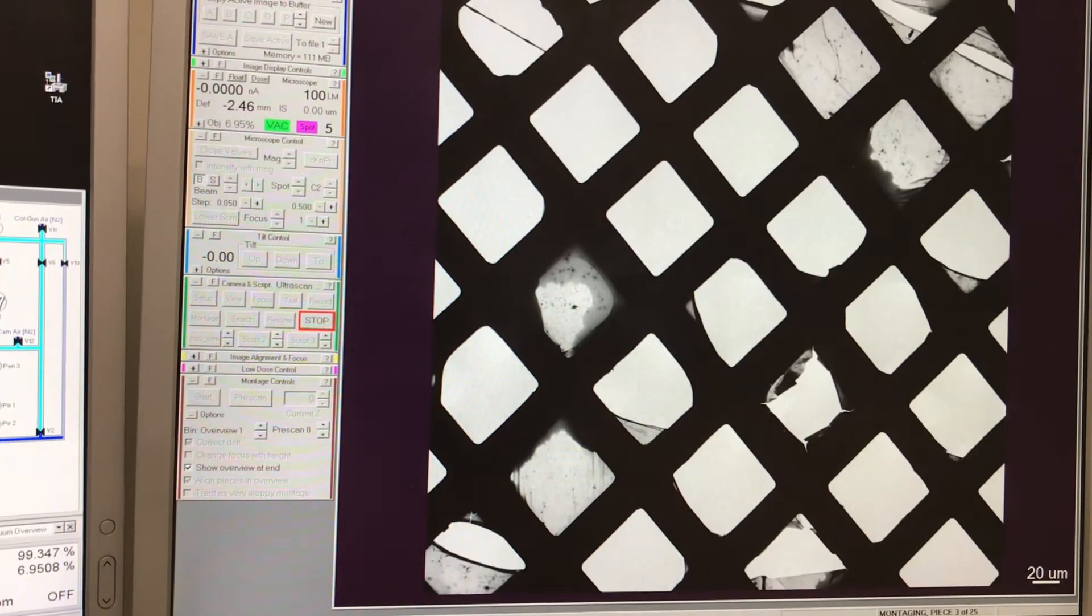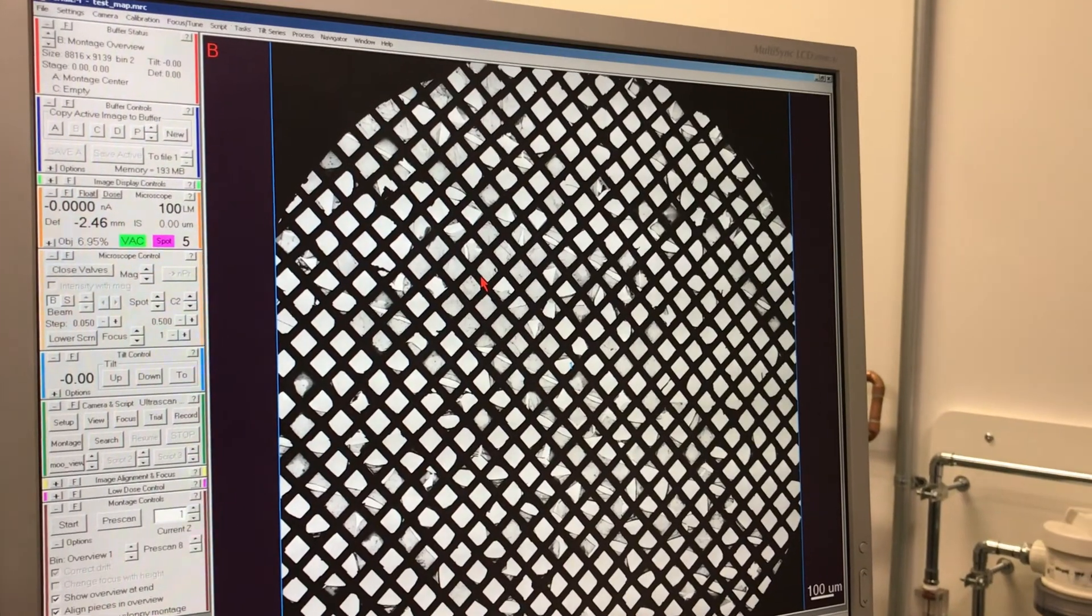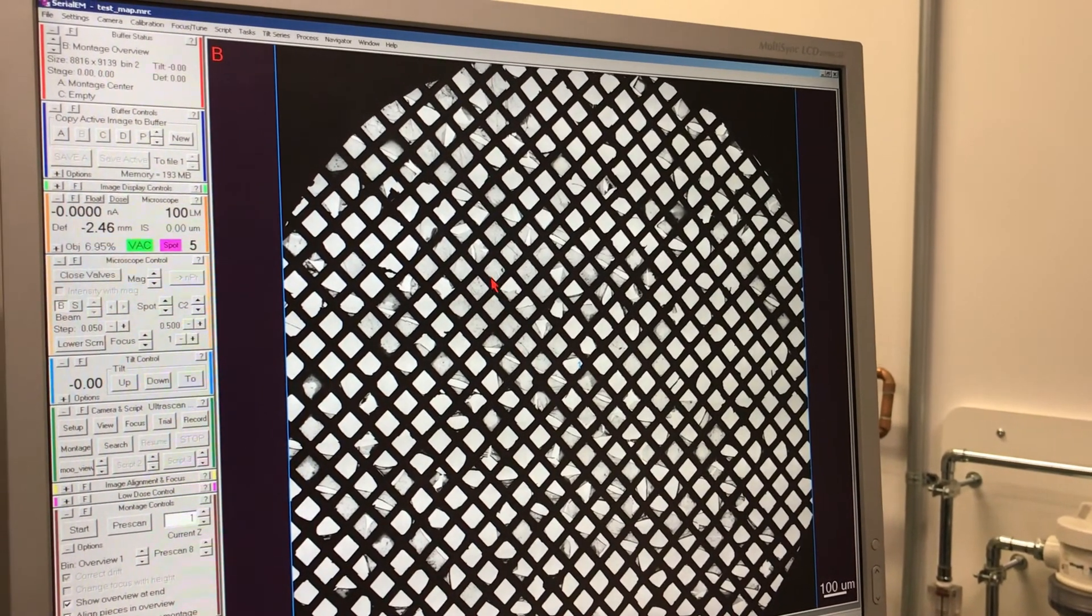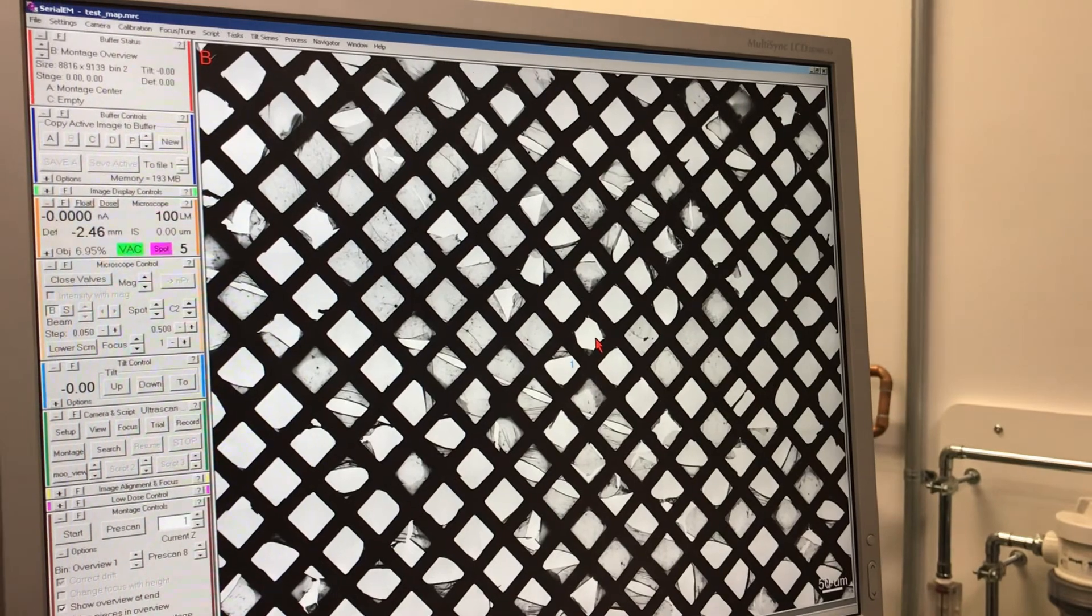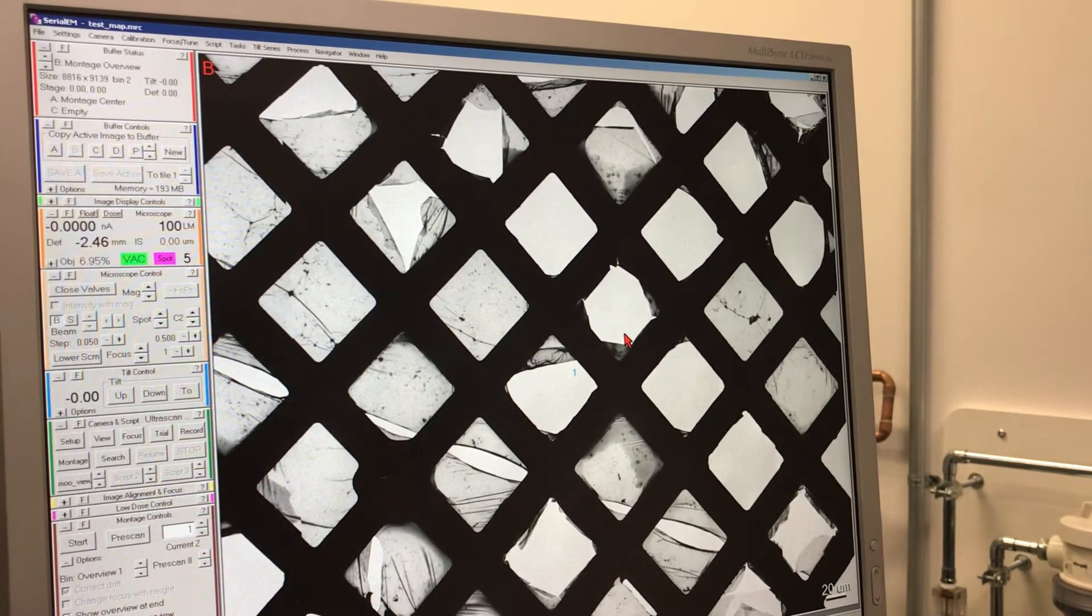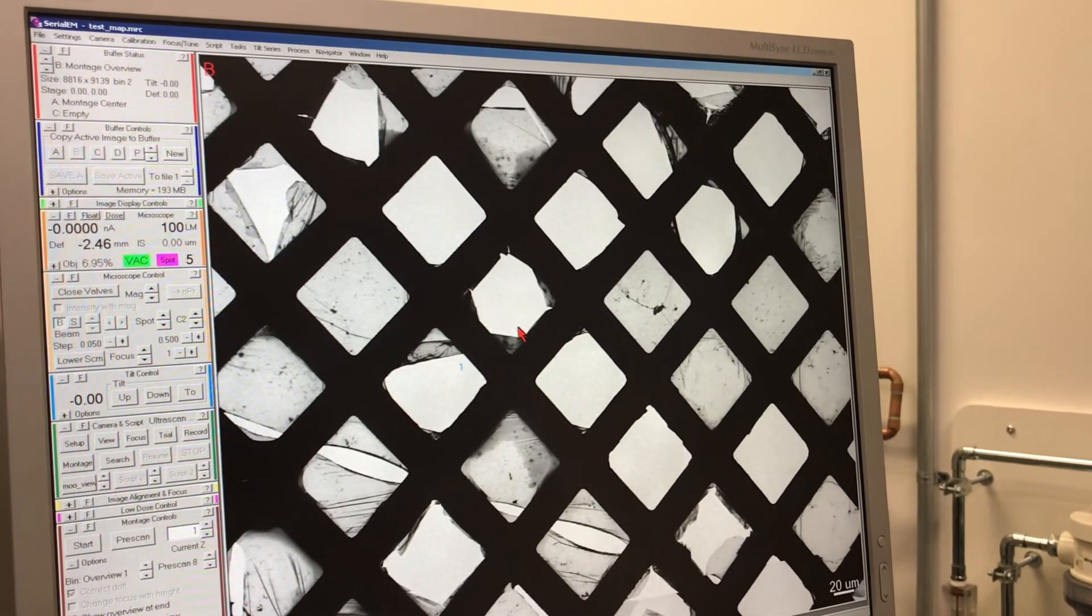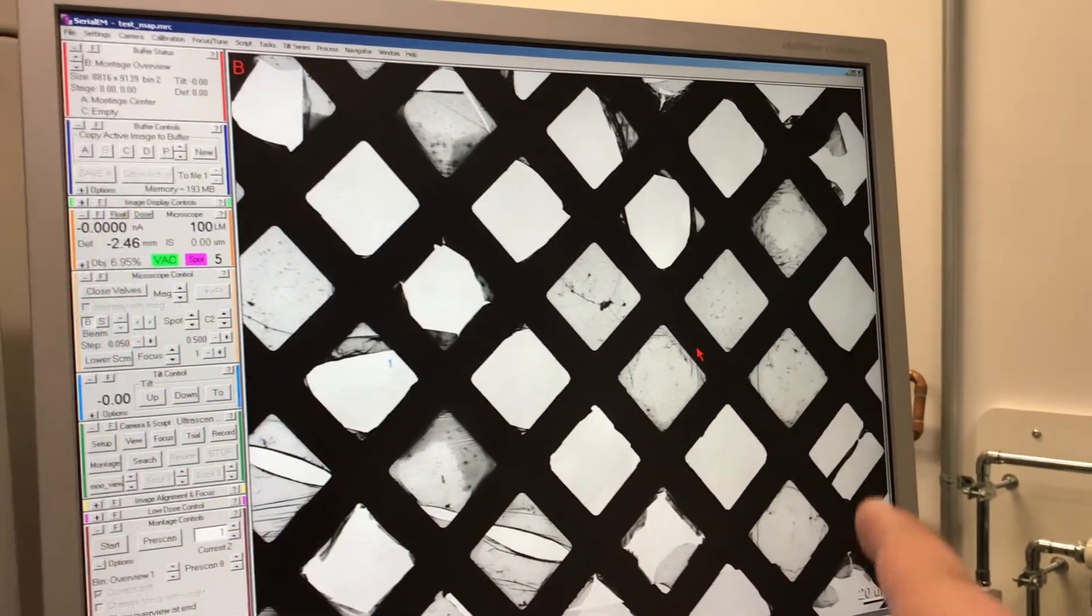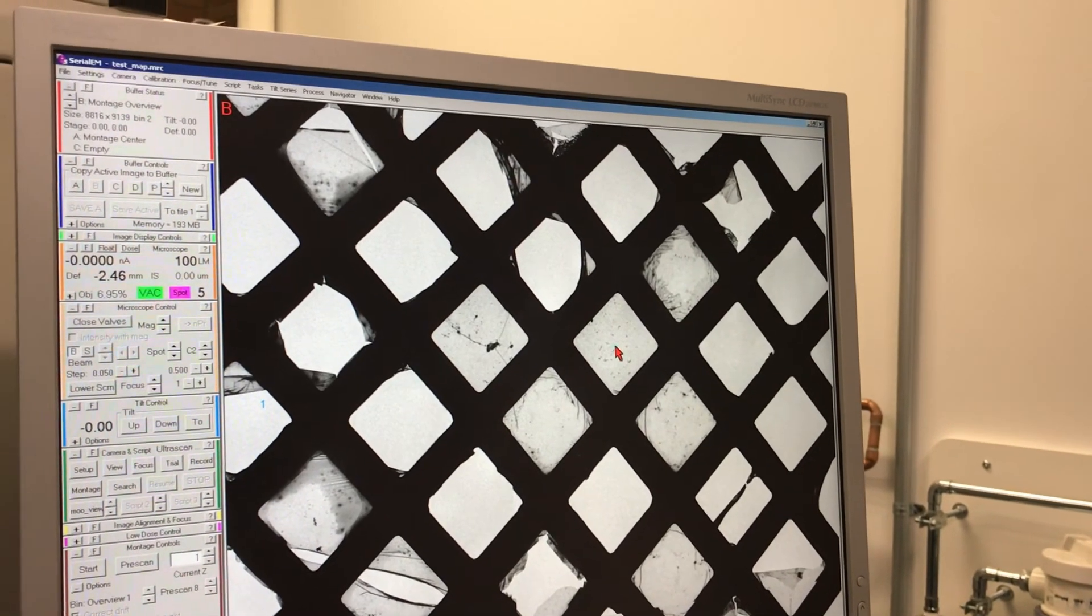Now we're going around the grid, and as you can see there are many areas where you have the support carbon layer that is broken, and there are areas where the carbon layer is intact. We want to take an image where you have the carbon.